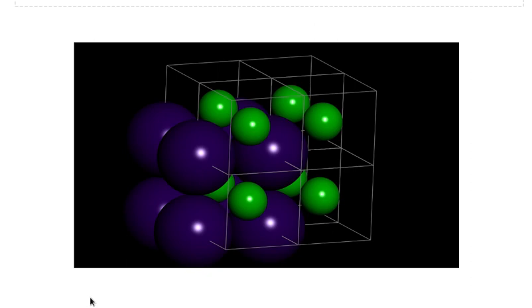And then finally for both systems we would like to calculate the densities. And of course the densities of lithium chloride and cesium chloride are very well known, and so you can always check your answers for the density against those that are easily available on the web.